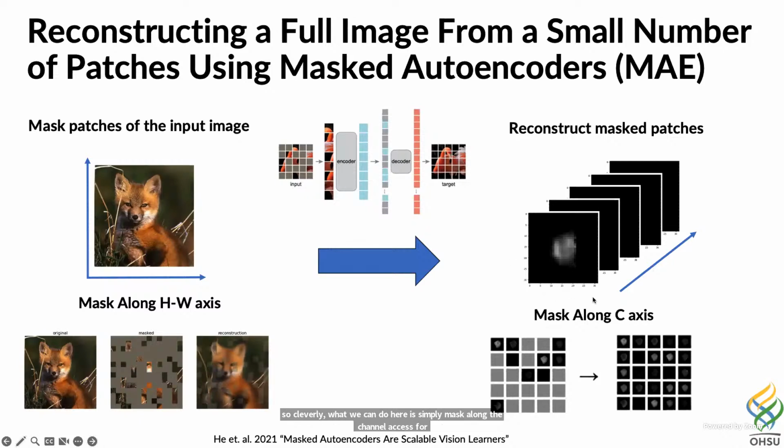What we feed in as input are the single cell images cropped to a 32 by 32 pixel region, and then they have the 25 channels for each marker stain. Conveniently, the 25 markers can be reformatted into this 5x5 grid where essentially each patch now is a single image channel, and we can just mask channels the same way that we were masking patches in the original implementation.